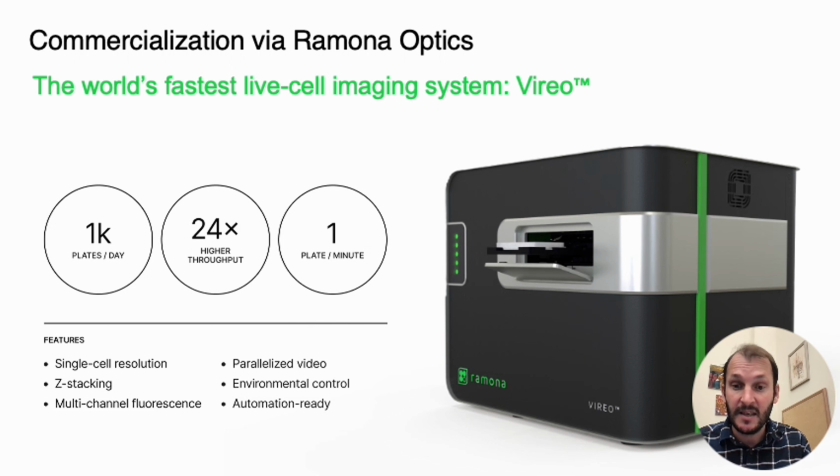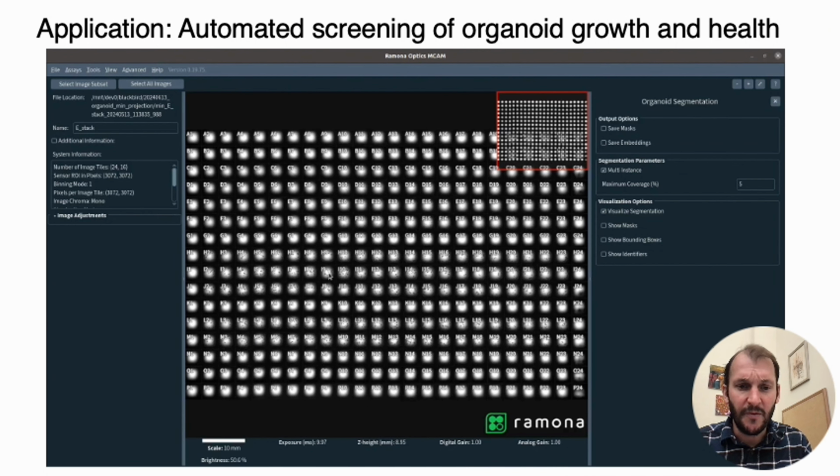It can image an entire 96 well plate with fluorescence in a minute. It can image an entire 96 well plate just with bright field capture, including Z-stacking, in about 15 seconds. So it's very fast and an interesting new technology that embodies a lot of the features I just explained. So folks are using this new technology to do screening of organoids, like I just mentioned.